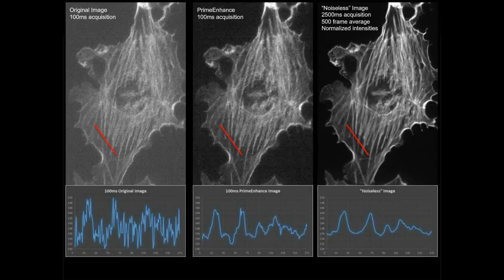So you can see that peak, you can see that valley, you can maybe see this one, but let's see, I can highlight stuff. In this area, you're sort of losing out. And so when you turn on the denoising feature, what you get is clarity in that same region. It's not about amplifying the signal, it's about reducing the noise that's present in the image.